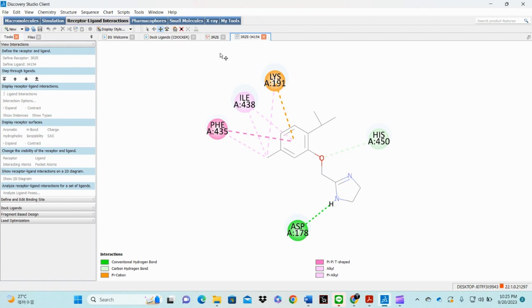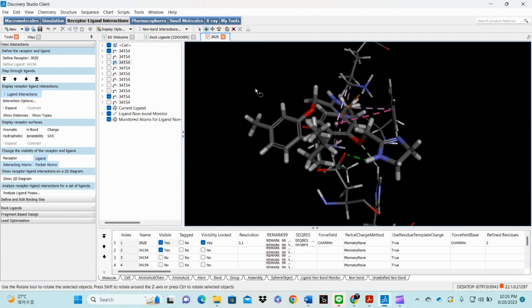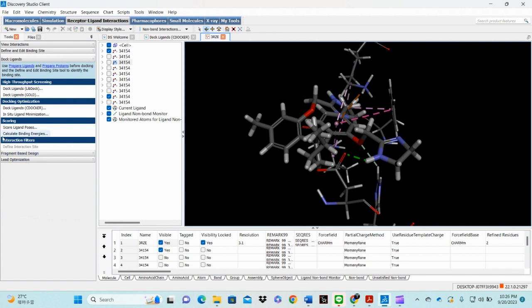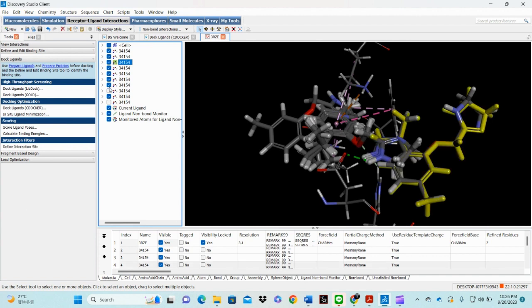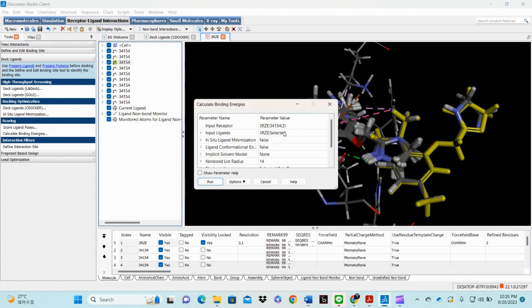If we want to calculate the total binding energy of the ligand molecule with the active site of our receptor, we can use the tool in Discovery Studio to calculate binding energy. To calculate the binding energy of all the molecules, we need to select all the ligand molecules. We put here 'Calculate Binding Energies'.